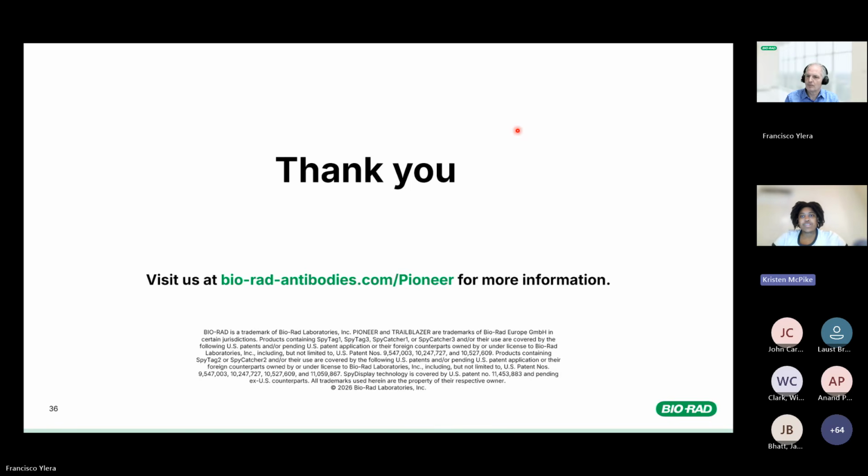Thank you. Next question comes from Praise Aguntunkun. You talked briefly about selecting pH-sensitive antibodies. Can you describe how these libraries were designed and the antibodies selected? Yeah, library design, it's our Pioneer library, so there's no difference in the library design.